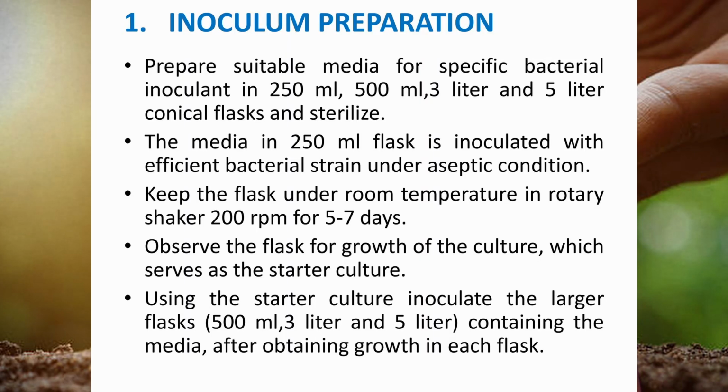Prepare the suitable media for the bacterial strain in 250 ml, 500 ml, 3 liter and 5 liters conical flask and sterilize in the autoclave. After the sterilization, we have to inoculate the bacterial culture into the flask. Keep the flask at room temperature, 27 degrees Celsius, for 5 to 7 days.